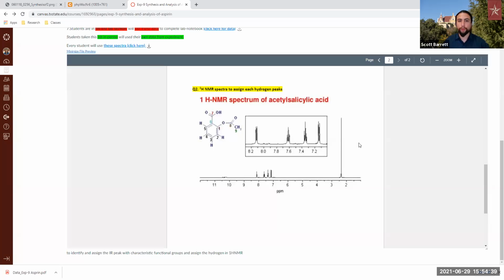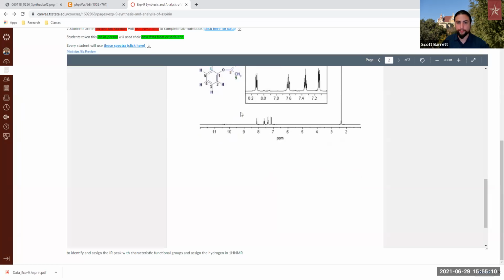And then go forward into the NMR spectra, and you need to localize every one of the individual carbons here. I do see a carbonyl marked as 8. Don't worry about the carbonyl. What you need to worry about is the protons. This is a proton NMR spectra, so make sure that you can analyze where you would find the hydroxyl group, all of the aromatics, and then as well this ketone, CH3. In this case, it'd actually be ester. So this ester is CH3.